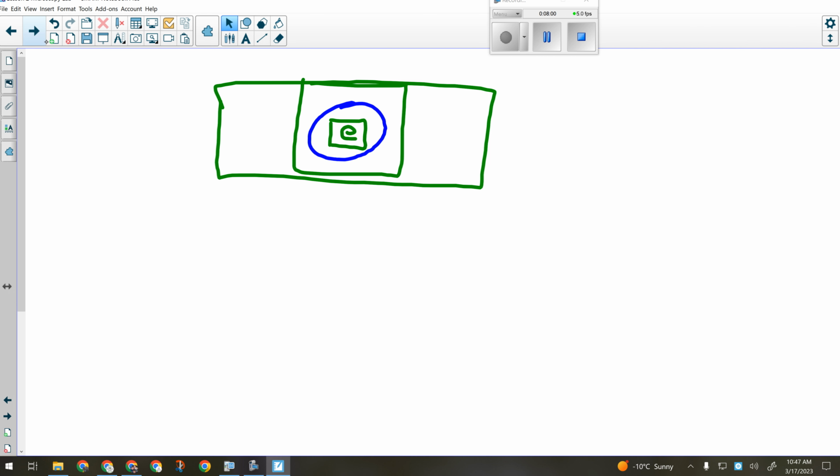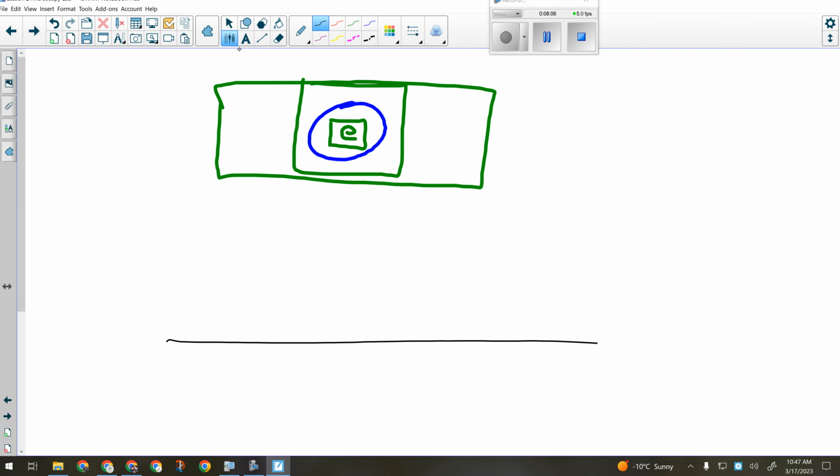So the way you do that is this. This is the slide. I'm going to put the letter E, when it's cut out, on the slide, so that would be the newspaper. So now I'm looking at it from this direction, right? This is from above, this is from the side. Then I'll drop the drop of water on there. And it'll make a bubble because water is what kind of molecule? Polar molecule. That's going to be important for the analysis, by the way.